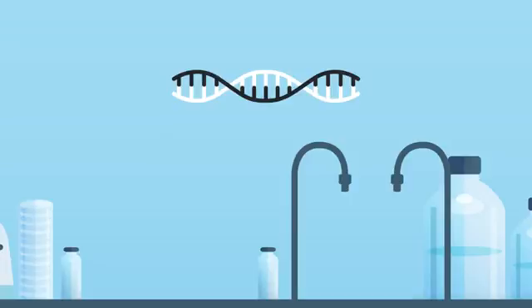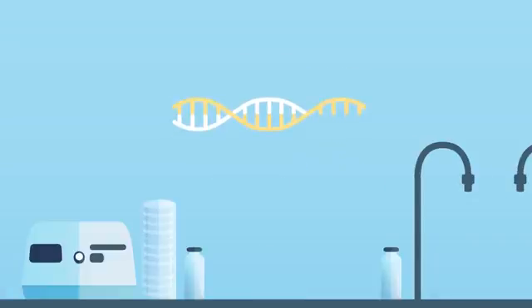One type of chemistry is a dye-based detection method, where a fluorescent binding dye is used that is specific to double-stranded DNA. Alternatively, a probe-based detection method can be used, which would utilize a primer or probe that is labeled with a fluorescent reporter.